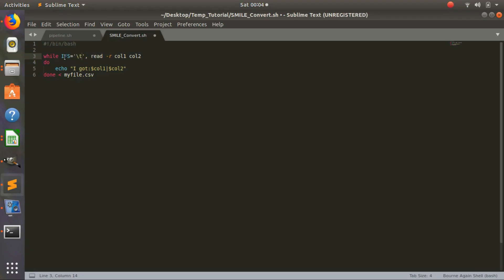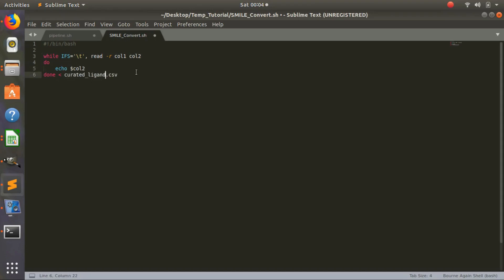So we'll use a while-read loop. IFS is the input field separator — our delimiter was tab, as we saw in the last video. Then we'll read column one and column two. Column one will be our ligand name and column two will be the SMILE. We can echo column two, and for our input we'll use curated_ligandlist.csv.